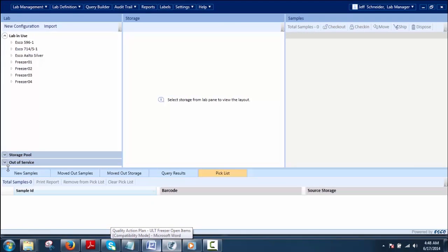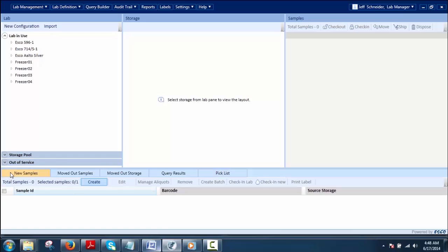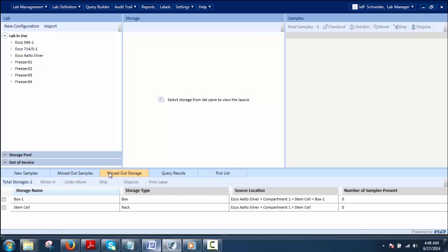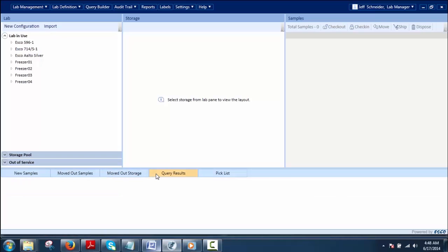Clipboard is a holding place for the following samples and storages. It is also a temporary holding place for new samples. Here you can see: new samples, move-out samples, move-out storage, query results, and pick list.